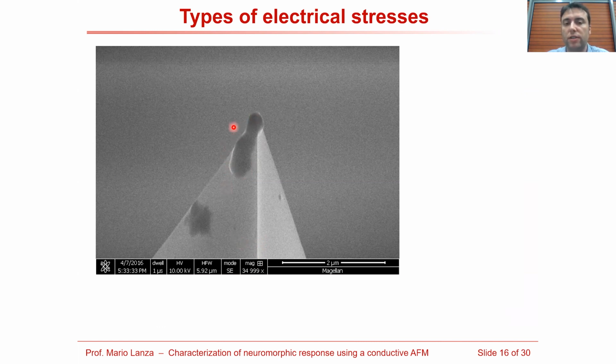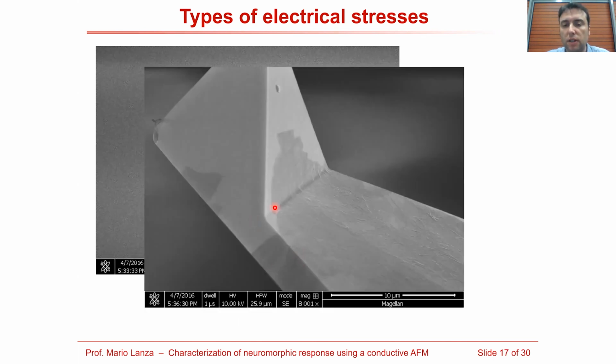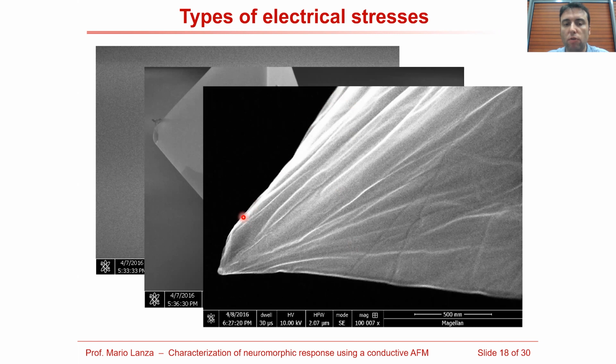Here, this is one SEM image of an atomic force microscope tip. We tried to coat it with the graphene oxide, but we failed. As you can see here, it is not a conformal coating. After practicing a little bit, we achieved some conformal coating of the cantilever, which is a flat and long surface. It is an easier surface to coat, but in the end, we managed to coat perfectly very complex, irregular shapes like the pyramidal tip of an AFM.